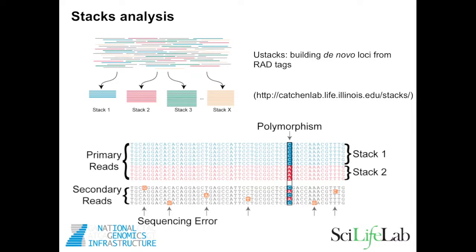For analysis, I usually use a pipeline called Stacks, and this is for working with this type of data without a reference genome, which is often the case.